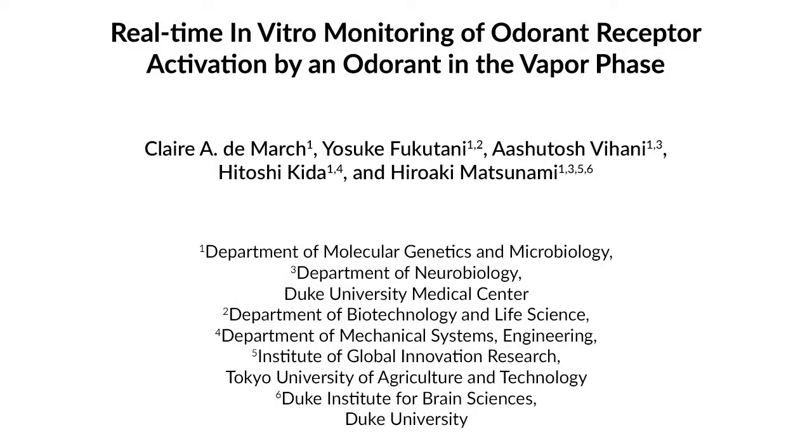Our protocol enables measuring detection and discrimination of volatile odors with a panel of odorant receptors. This method opens up the possibility to develop odorant receptor-based biosensors. This technique allows real-time in vitro monitoring of odorant receptor activation upon odorant molecules in vapor phase. It fills the gap between in vitro and in vivo approaches.